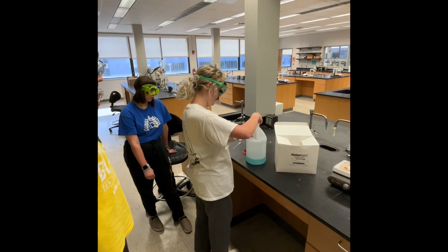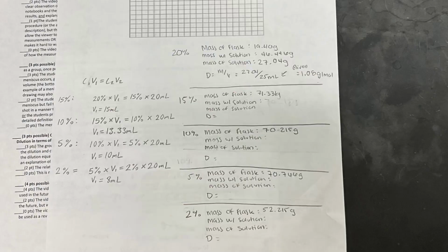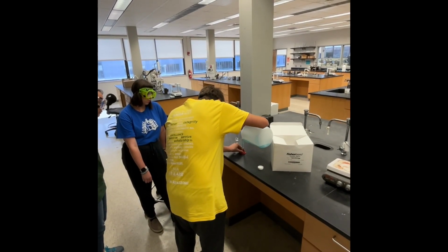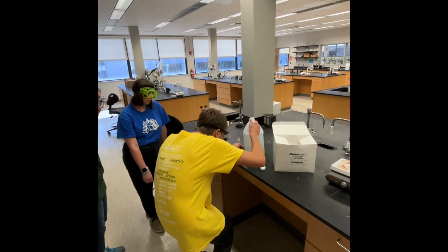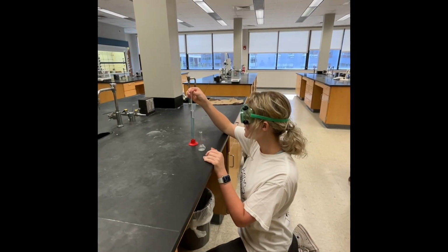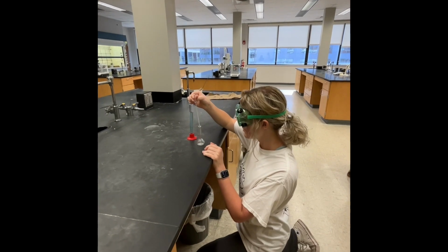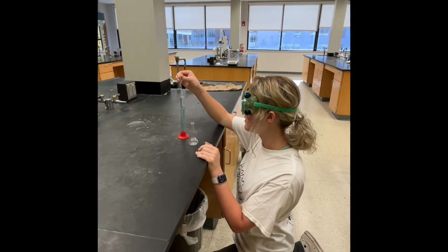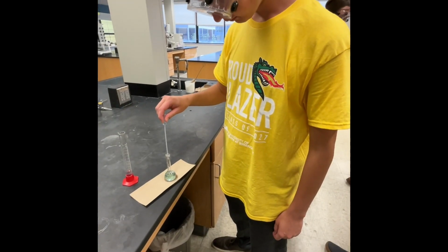As we add water to the concentrated sugar stock solution, the volume of the dilution, V2, increases. If M1 times V1 equals M2 times V2, then M2 must be less than M1. After that, we transferred the solution into our 25 milliliter volumetric flask with disposable pipettes to ensure accuracy.